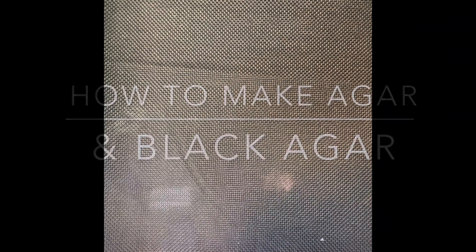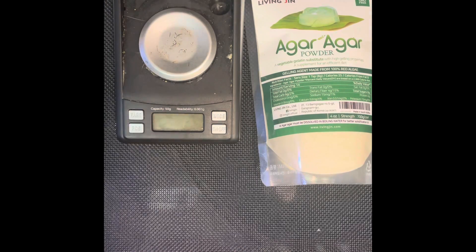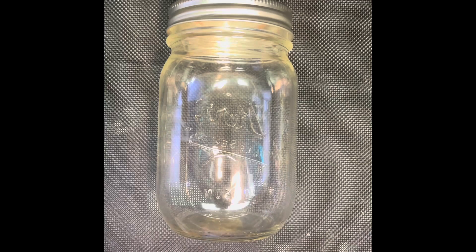Alright, what's up guys. This is how you make agar for petri dish use. Personally I use petri dishes for mushroom cultivation. I'm not too sure exactly what you guys are gonna use it for, but let's hop into the video. You're gonna be needing a scale, agar powder, malt extract, a jar, 500 milliliters of water, and a pressure cooker or stovetop.